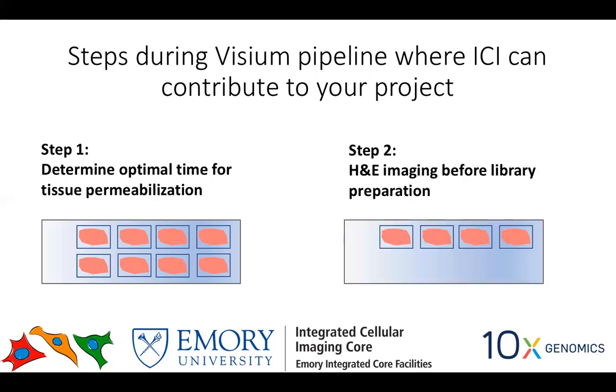And the second step is actually where you put the 4 tissues, as you mentioned, and we will do H&E imaging before the tissue goes into library prep. Okay.